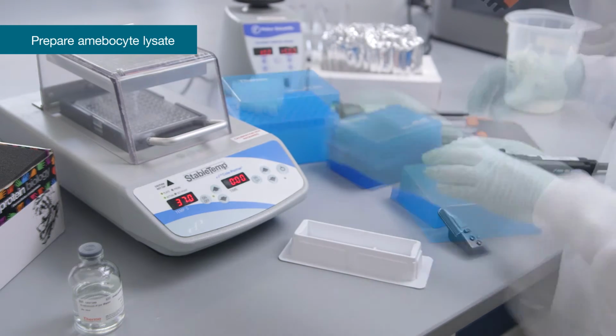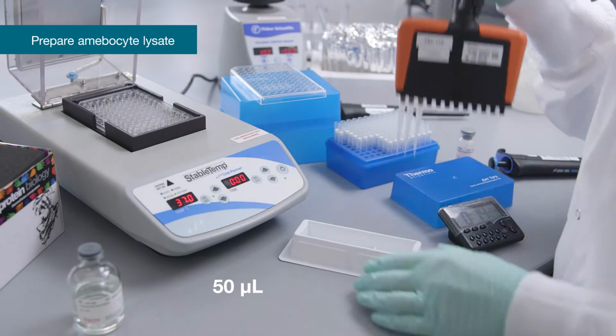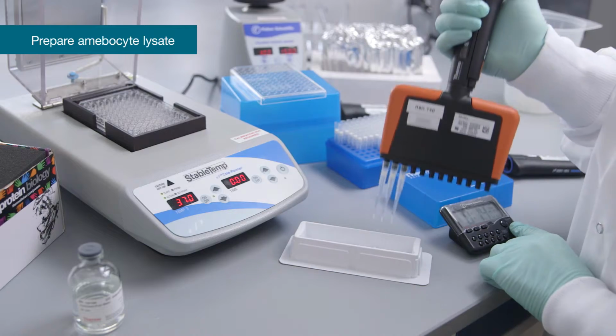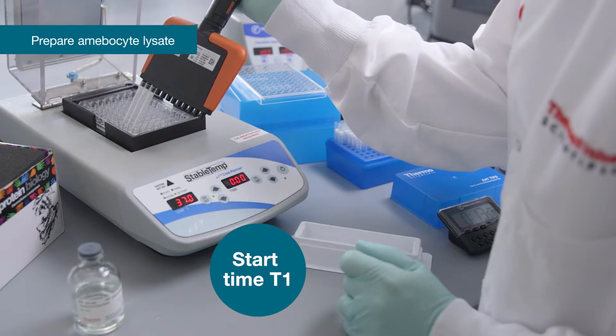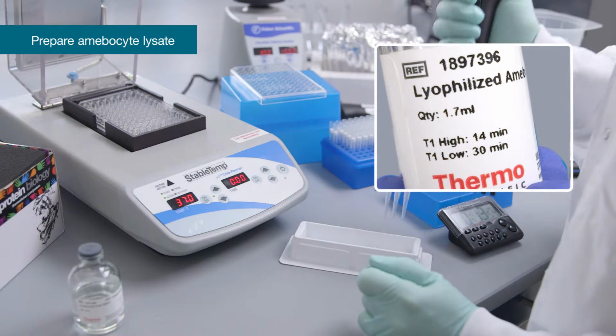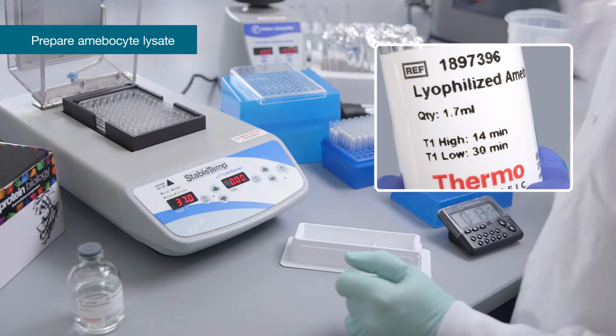Using a multi-channel pipette, add 50 microliters per well of the reconstituted amoebocyte lysate reagent. Start time T1 as the amoebocyte lysate is added to the first wells. Note that the time T1 incubation varies between the high and the low standard ranges, as indicated on the vial.